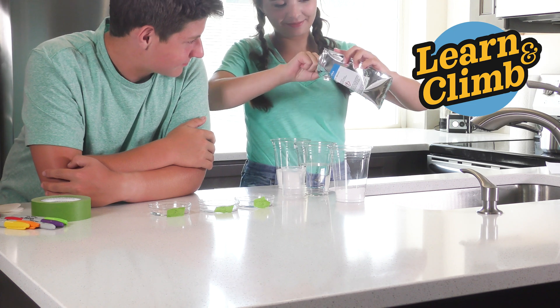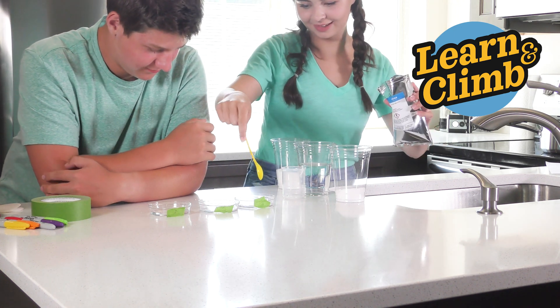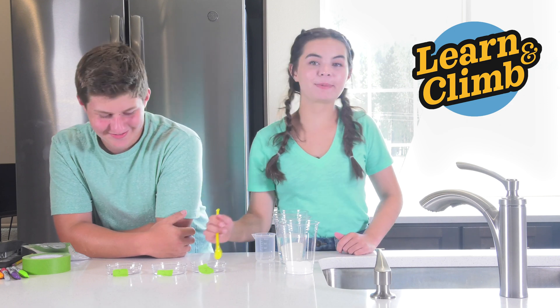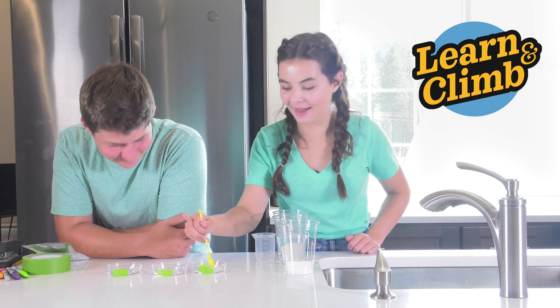Try not to spill these — I did that many times. Now you're just going to mix each petri dish until all of it is dissolved. This can take a while, so be patient.